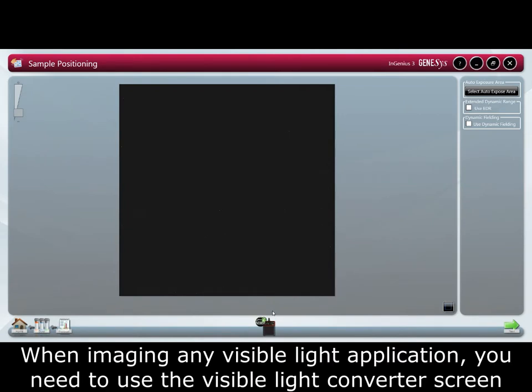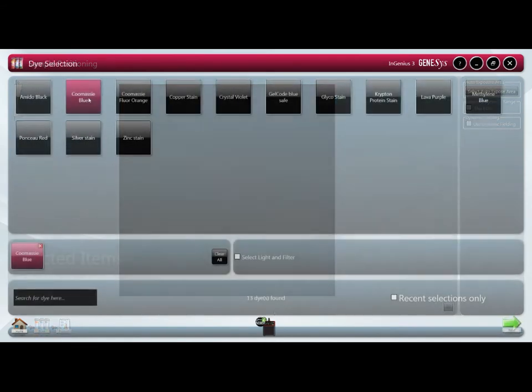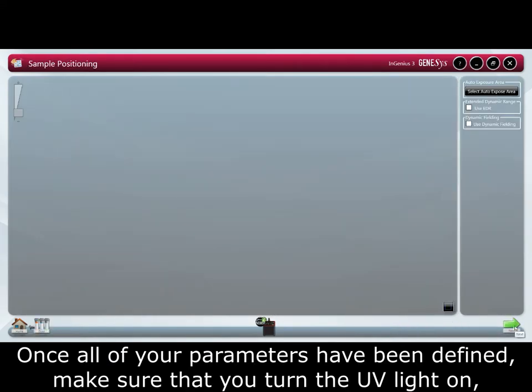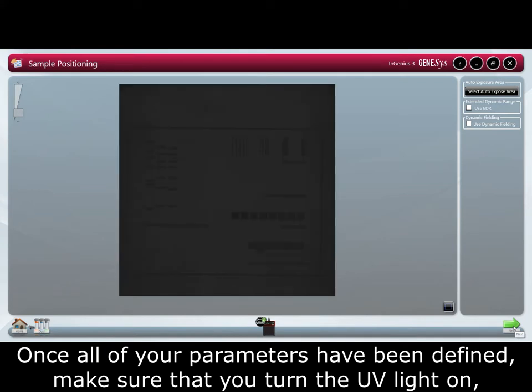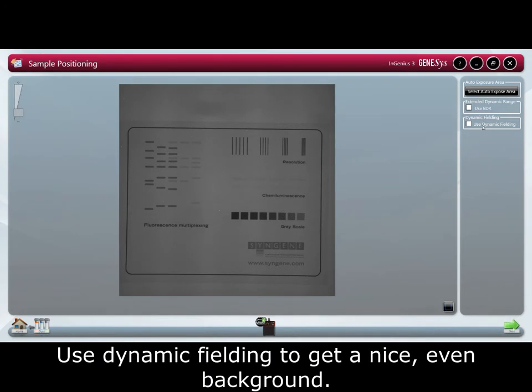When imaging any visible light application you need to use the visible light converter screen. This is a white screen that is placed directly on top of your transilluminator. Once all the parameters have been defined, make sure that you turn the UV light on and that the gel has been positioned correctly with the sample positioning page. Use dynamic fielding to get a nice even background.